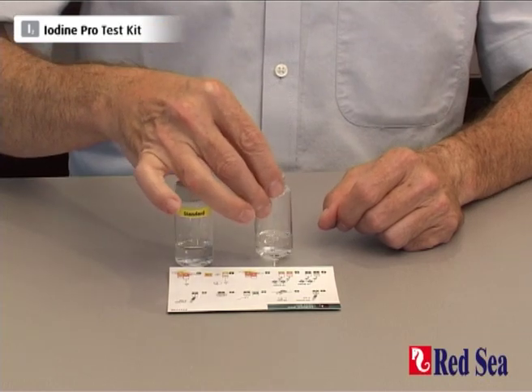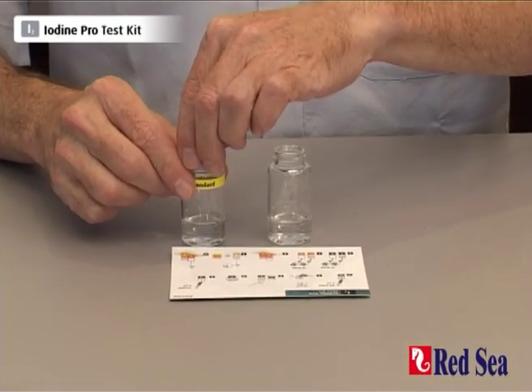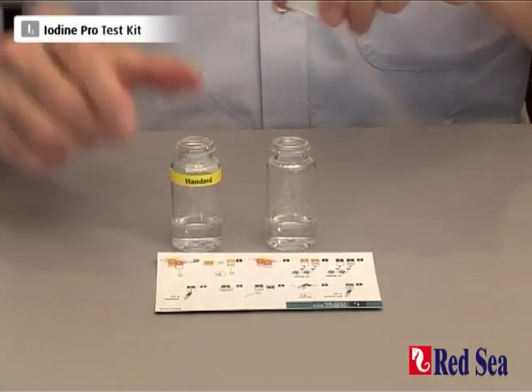I've already prepared a sample of water with 5ml and we now do the test on both the standard solution and the water sample simultaneously.